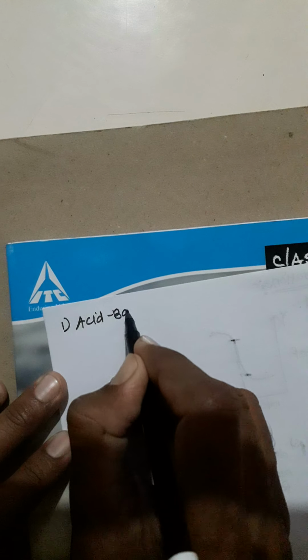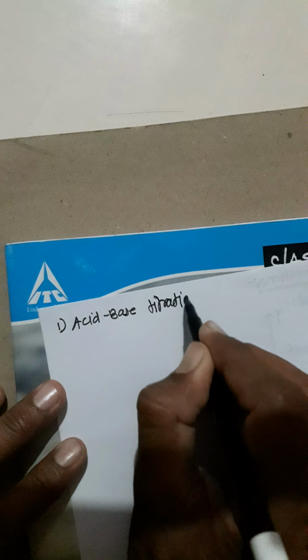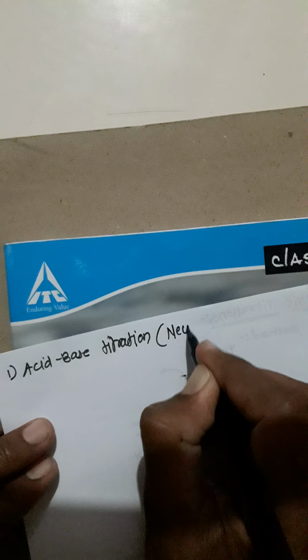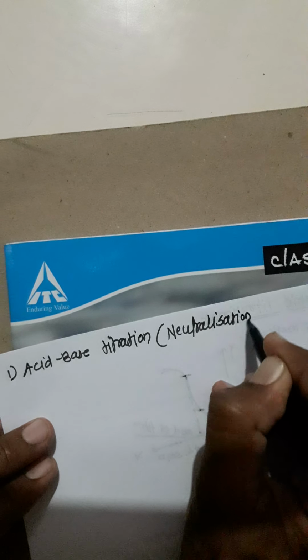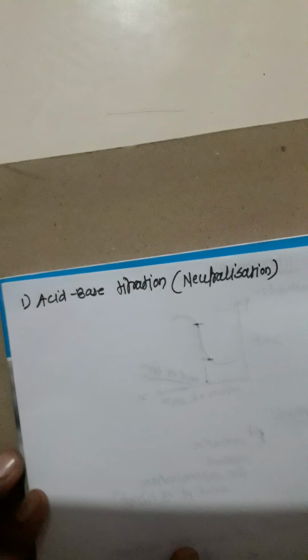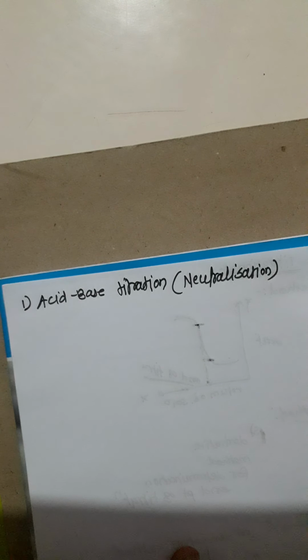Acid base titration. This titration is also called neutralization titration.